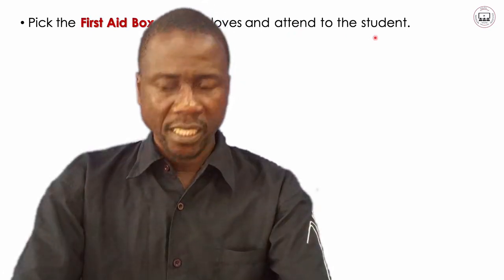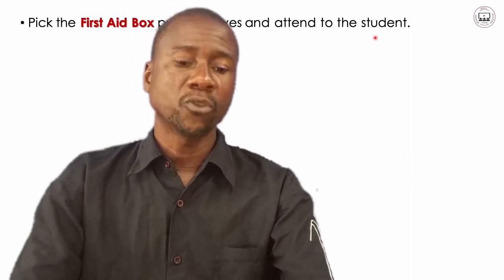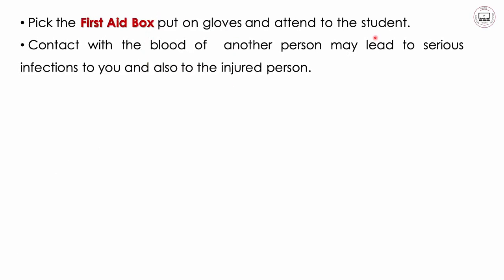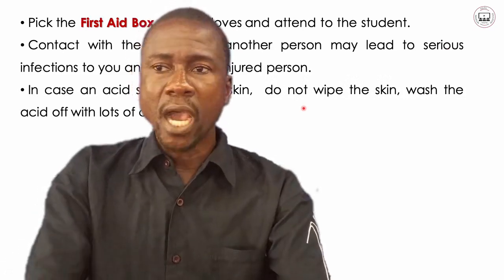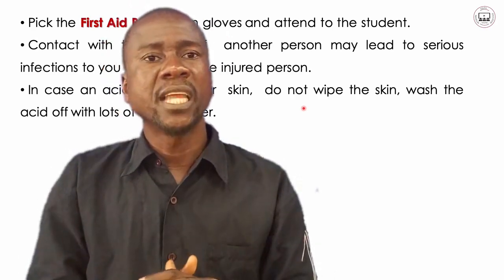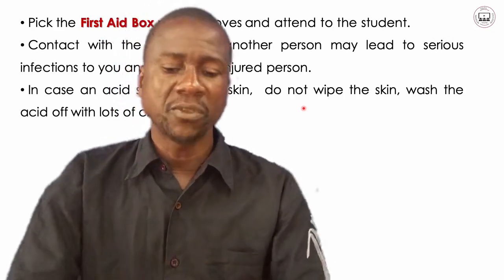Pick the first aid box, put on gloves, and attend to the student. Yes, the gloves will help protect you so that you do not catch that blood with your direct or bare hands. Contact with the blood of another person may lead to serious infections to you and also to the injured person. So it is necessary that you put on gloves so that you attend to that person properly.